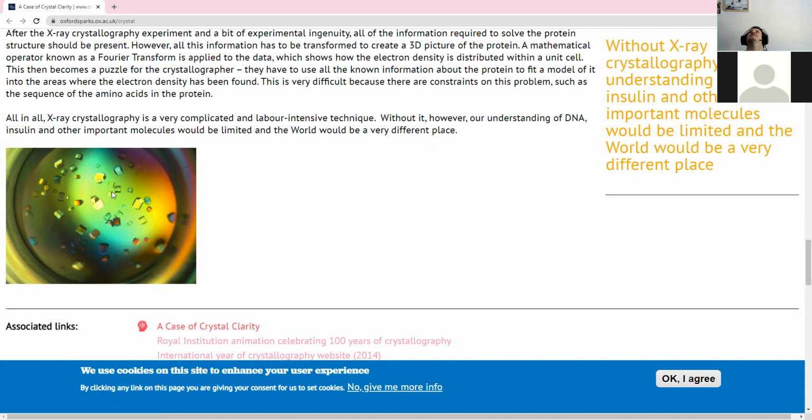Oh my gosh. A synchrotron, there we go. So if you're in Australia, you'll send your samples to the Melbourne synchrotron. And what they'll do is they'll shoot X-ray beams through it. Behind the crystal is a plate that basically absorbs the X-rays and prints out a computer image of where the X-rays made it through.